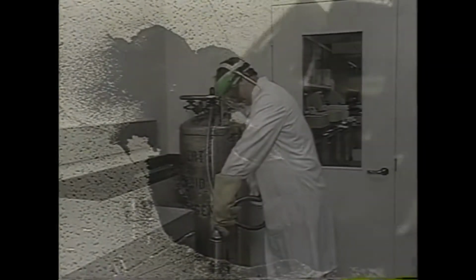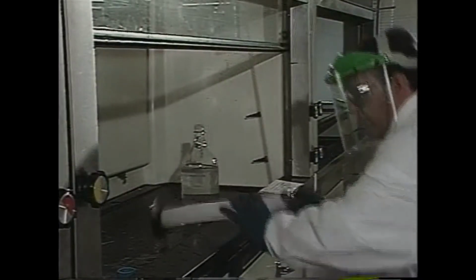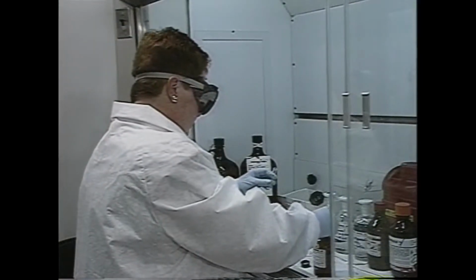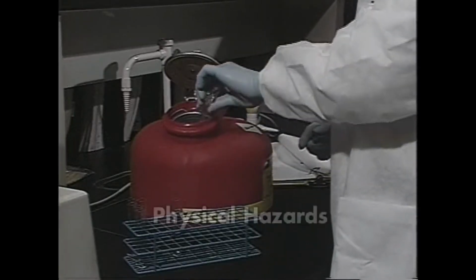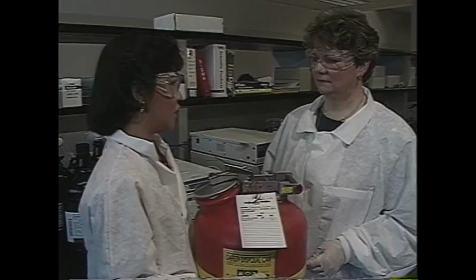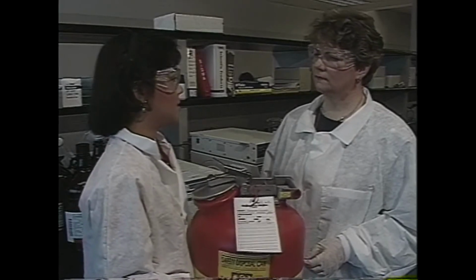So far, we have only talked about health hazards associated with chemicals. That's because they are the focus of OSHA's laboratory standard. But we must protect ourselves from other dangers in the laboratory as well. Some chemicals can present physical hazards. For instance, working with flammable or combustible chemicals requires special precautions. These types of hazards are covered by OSHA's Hazard Communication Standard.